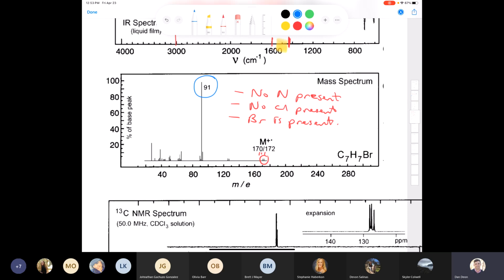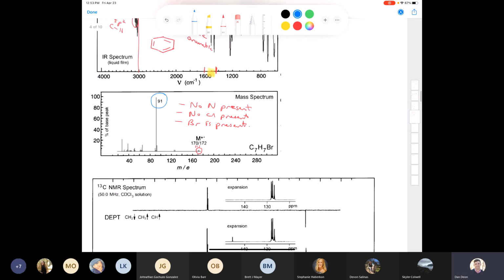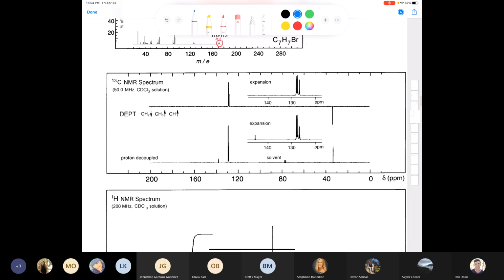So let's skip that. Skylar says aromatic, question mark. You're definitely in the right vein, right? Because if you have a phenyl, this ion has a mass over charge of 77, and 91 is more than that. What did Advita put? C7H7. Yeah, that's the right formula. Yes, it's C7H7 plus. That's a very good answer, Advita. But there's a name for it, and you know what? Let's just skip it. Let's take a look at the carbon.